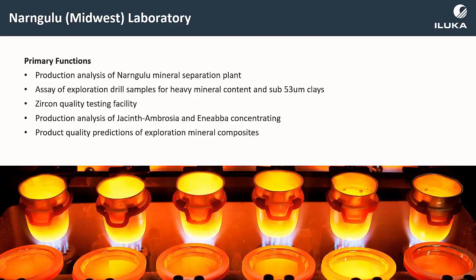We produce a zircon glaze and apply it to a tile, measure the colour of that tile and compare it to our reference standard. And we also, in the Midwest, undertake quality predictions of products that could be produced from our exploration drill samples.